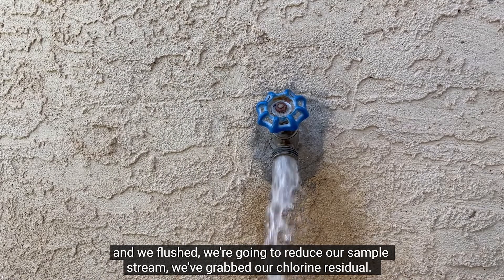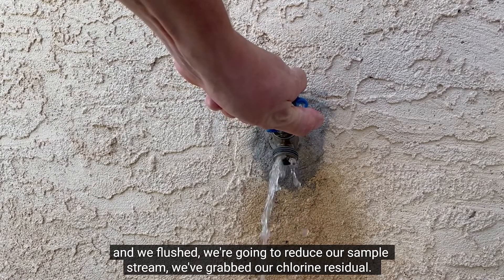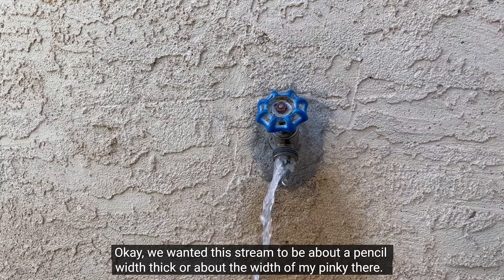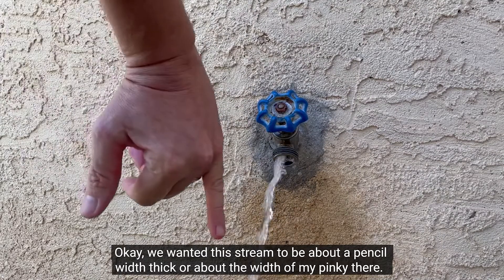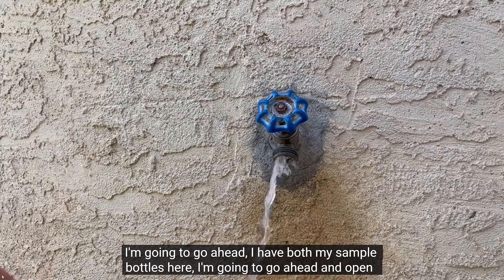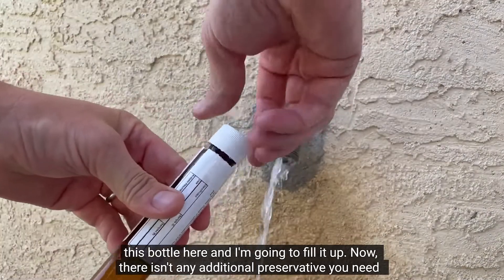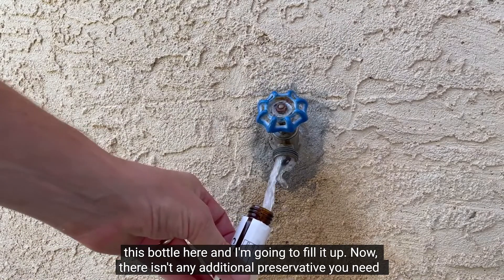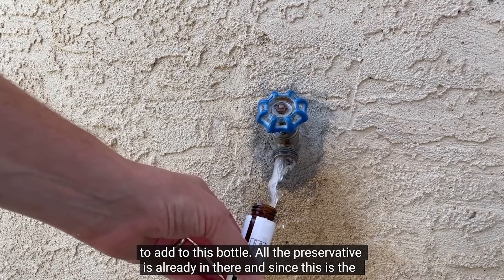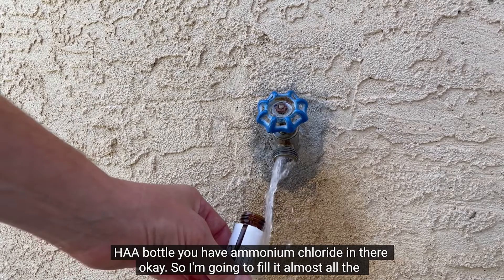We've gone ahead and flushed, we're going to reduce our sample stream, and we've grabbed our chlorine residual. We want this stream to be about a pencil width thick. I have both my sample bottles here, and I'm going to open this bottle and fill it up. There aren't any additional preservatives you need to add to this bottle — all the preservatives are already in there. Since this is the HAA bottle, you have ammonium chloride in there.